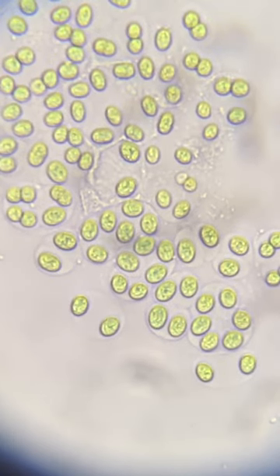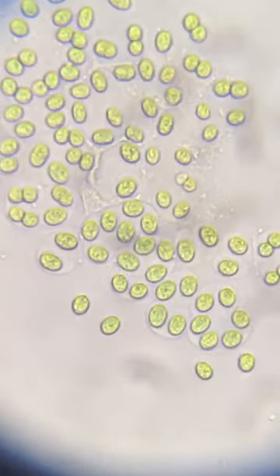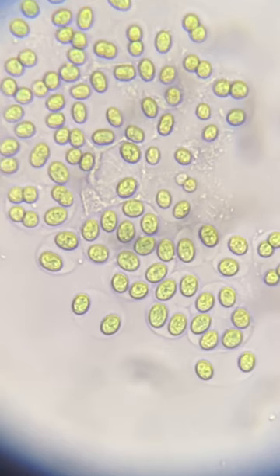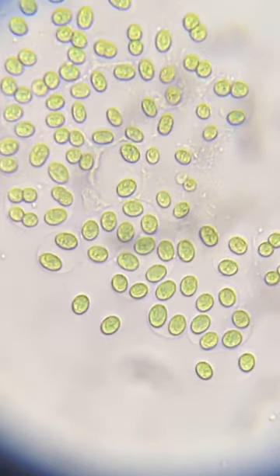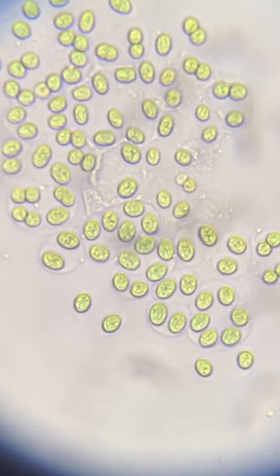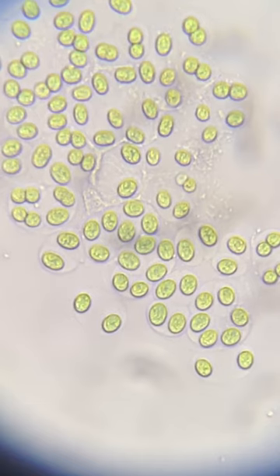Gloeocapsa is a cyanobacteria, also known as blue-green algae. If you look carefully, you can see inside of the green area the vegetative cells — it is green in pigment and color, so therefore it can photosynthesize. Gloeocapsa lives in freshwater and it is a cyanobacteria.